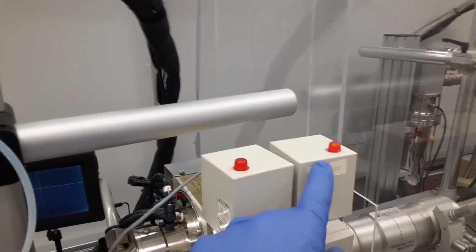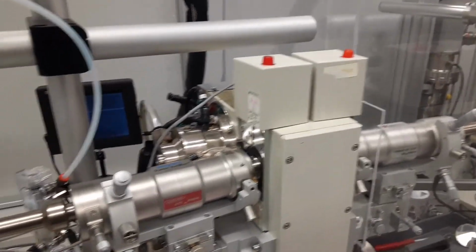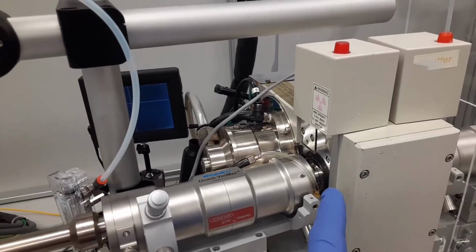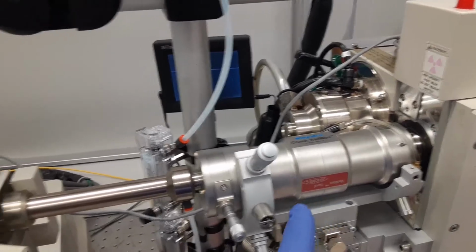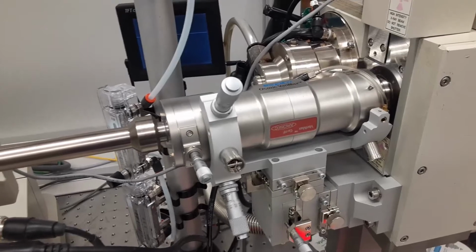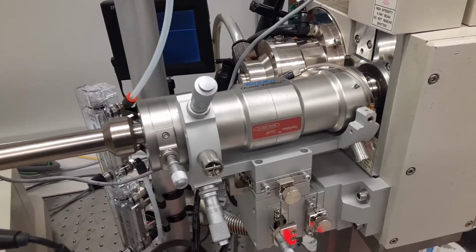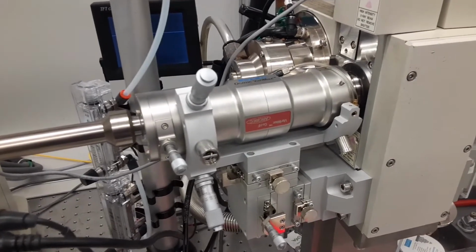These two small lights here are the shutter lights, and those only illuminate when the shutter is open and X-rays are allowed out of the tube tower. In between the tube tower and the mirror is a small beryllium window, which I'll show in detail in a minute. So the X-rays are able to go through the beryllium window when the shutter opens into the mirrors here. And the mirrors doubly reflect the X-ray beam, and what that allows for is an improvement in the intensity of the wavelength that we want, which for copper anodes is 1.5418 angstroms.